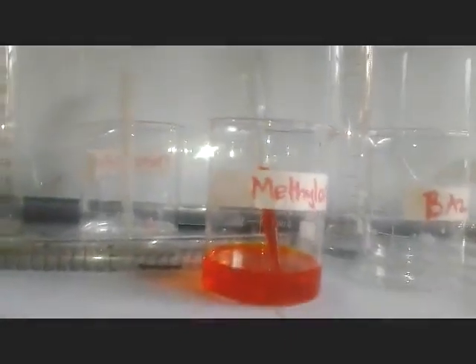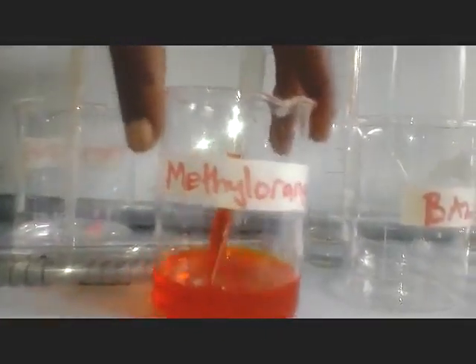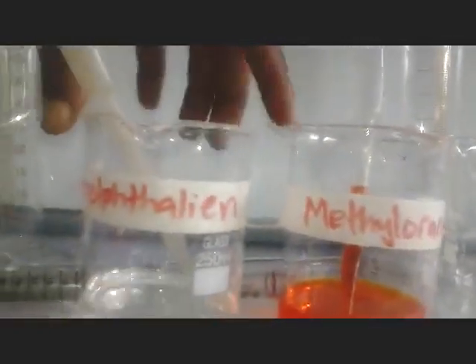Then you always use what you call an indicator. The common indicators which we use, one of them is known as methyl orange indicator. This one here. And another one is known as phenolphthalein indicator.